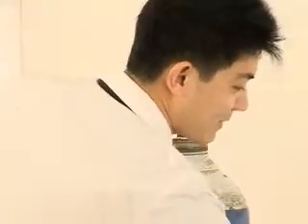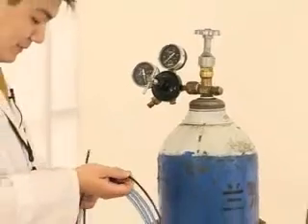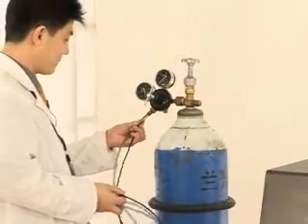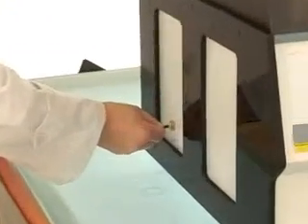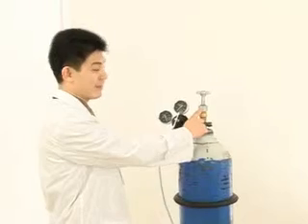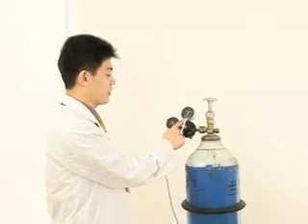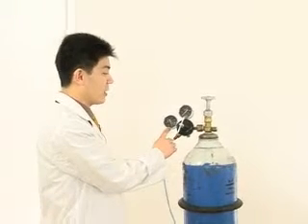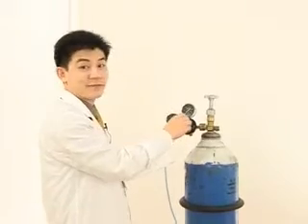And then, with the gas pipe, link the mainframe and gas tank. This one is the main valve, this one is the output valve, this one is the main manometer, this one is the output manometer. Before you open the main valve, you must be sure the output valve is closed.